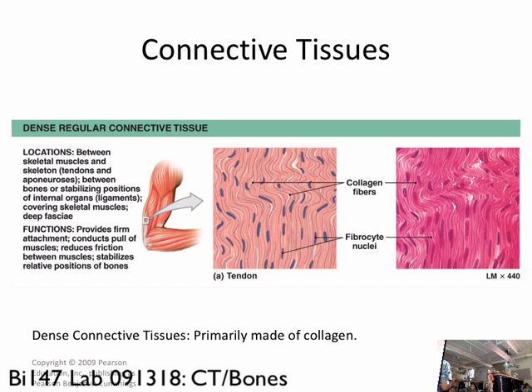These are a type of fibrocyte that are making the collagen fiber. It's a fibrocyte because it makes collagen. And it's making dense regular stuff. Is there anything else on that under dense regular CT? That's it? Okay. Any other questions before I move on?